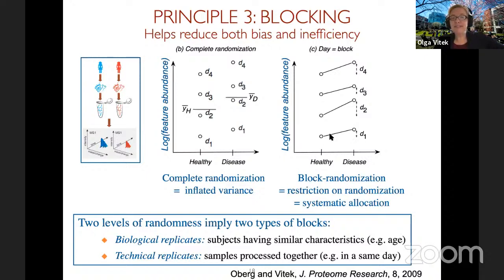So yes, you did a paired t-test within each day, but you now ended up with 4 differences, right? What a paired t-test would do is test the null hypothesis that the population mean of these differences is 0. And so you would need to combine these differences in a single model to test this hypothesis.